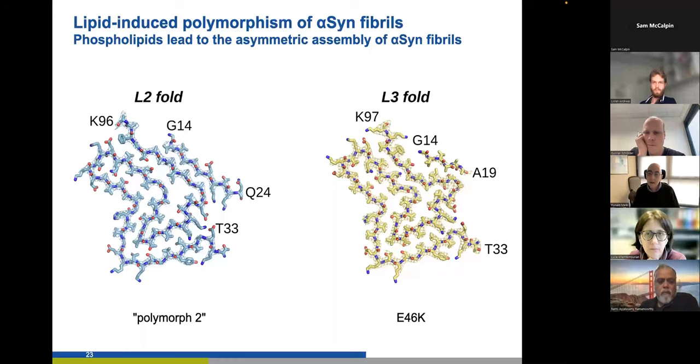There was another question from Suba Hao. He or she was asking how we fragment the fibrils and how we ensure that they are 50 nanometer long. This is described in the materials and methods of most of our recent papers. And we ensure that they are 50 nanometer long, both by electron microscopy, negative staining, but also by analytical ultracentrifugation. So we measure their molecular weight, basically, apparent molecular weight.